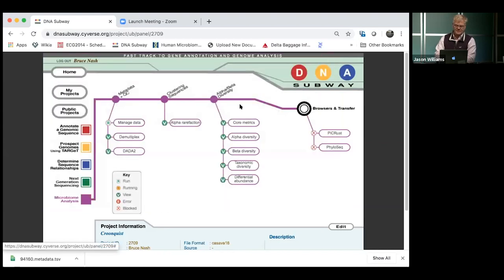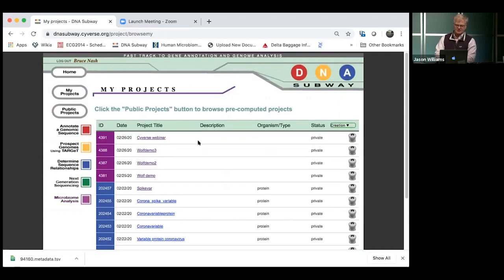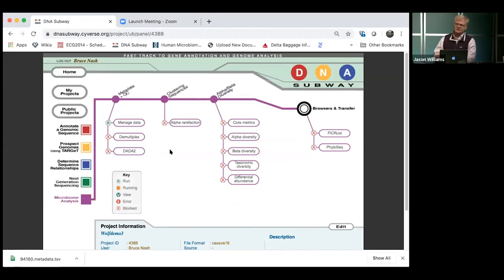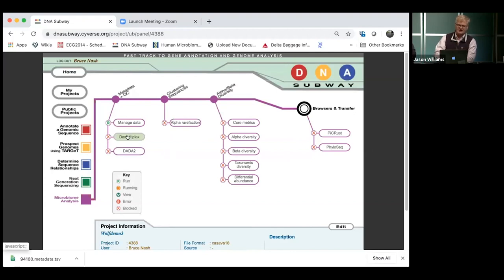Demultiplexing is when you take the many sequences in FASTQ files — potentially hundreds of thousands — and separate them into particular samples using the metadata file and QIIME2. In our pipeline, we actually demultiplex before putting things into QIIME2, which is why we have multiple sequence files for forward and reverse reads for each sample. What we're doing here is telling QIIME2 which files go with which samples and what the metadata is.